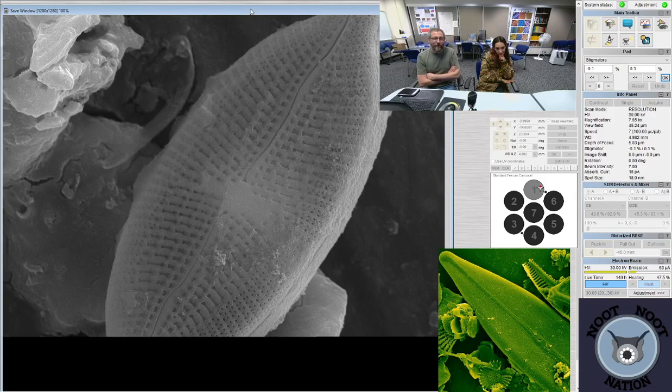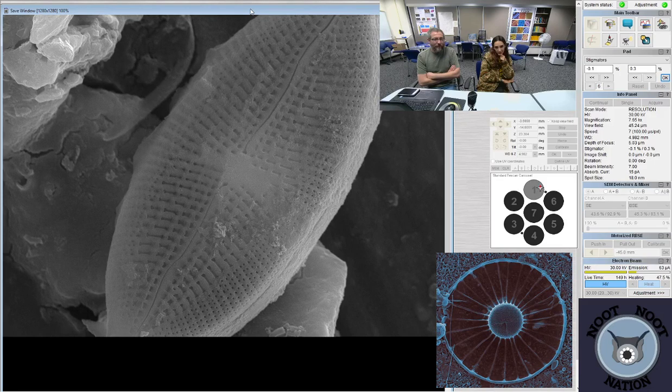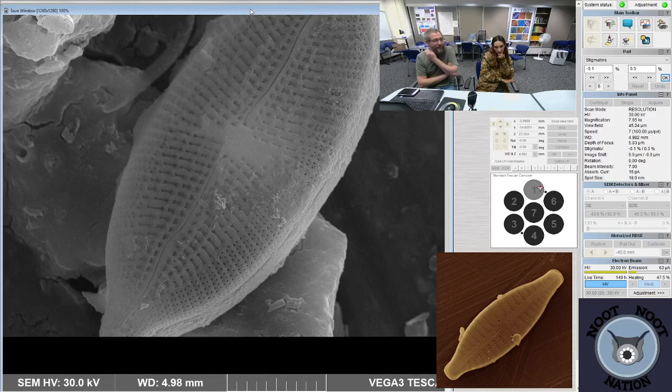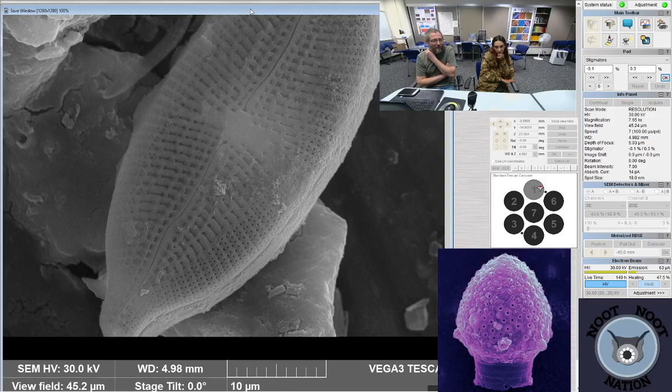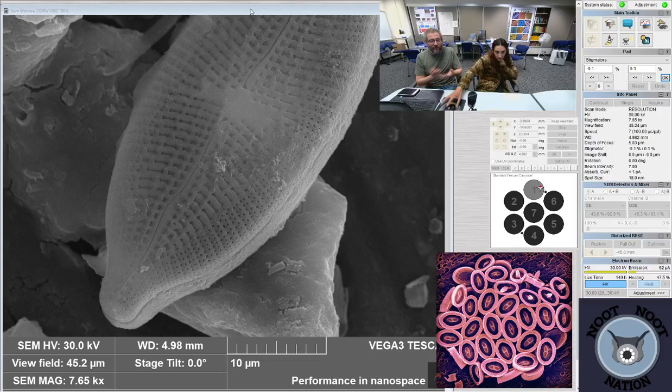Most of the time I use it for research purposes. But occasionally I will just stream things for fun, for science outreach. We don't put things in there that could harm the instrument in any way. I'm very careful about maintaining the integrity of the instrument. But we put fun things in there occasionally, and we sometimes stream from the SEM into just chatting. We put skin samples, or hair samples, or whatever we wanted, bugs. We had people send us Luna moths and the larva and the cocoon, but we still tried to make it educational.